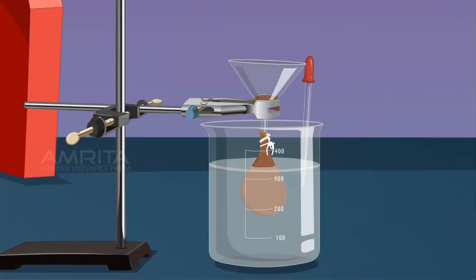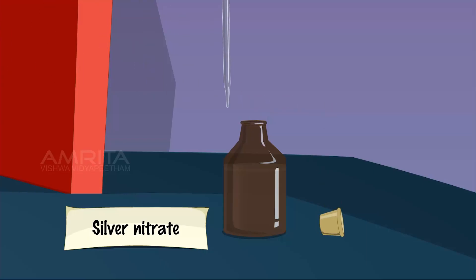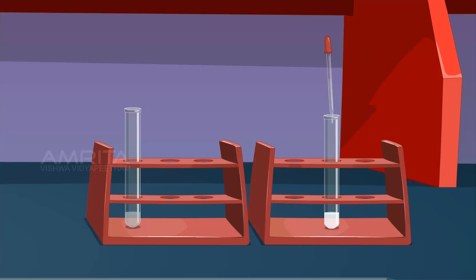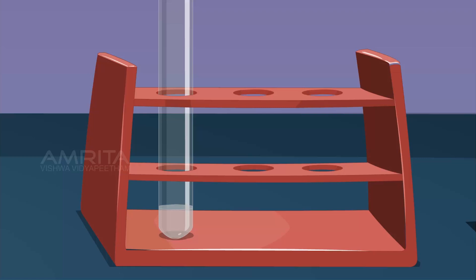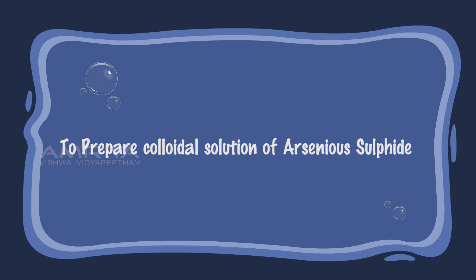Take a small amount of water from the beaker using a dropper and transfer it into a test tube. Take a few drops of silver nitrate solution using a dropper and add it into the test tube containing water. If white precipitate is formed, dialysis should be continued. If no white precipitate is formed, chloride ions are absent — this indicates that dialysis is complete. Otherwise, the sol still contains chloride ions and therefore dialysis should be continued.